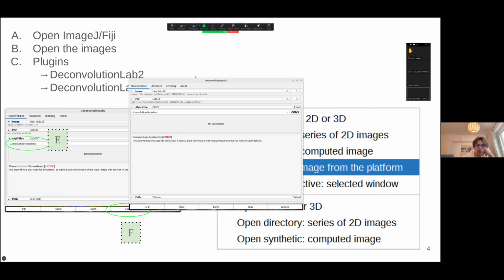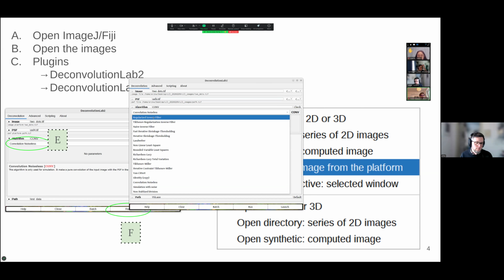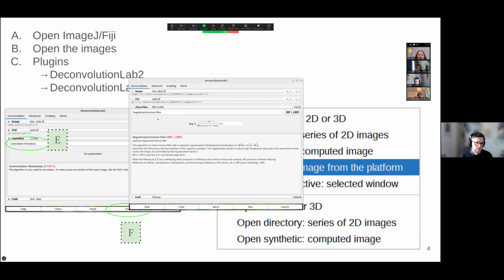You can try expanding the window maybe. Sometimes if the window's too small, everything gets cropped or some option is left out. But for me, it was at regularized inverse filter, and you just had to click that name, but it wasn't obvious that it was a button. Yeah, looks like that initially.